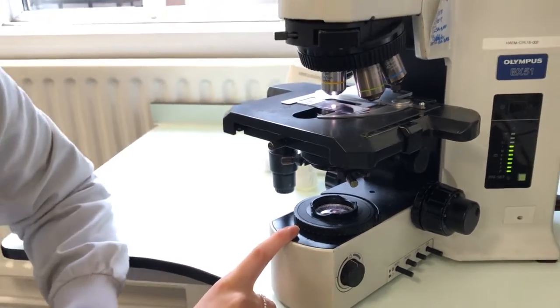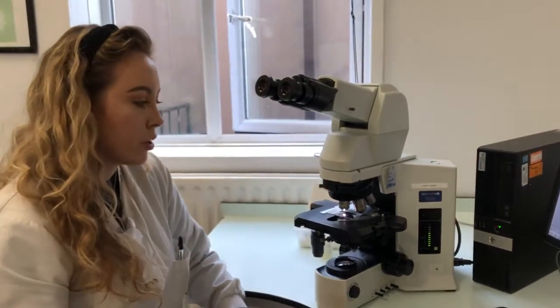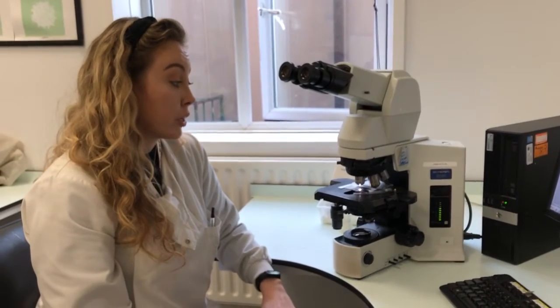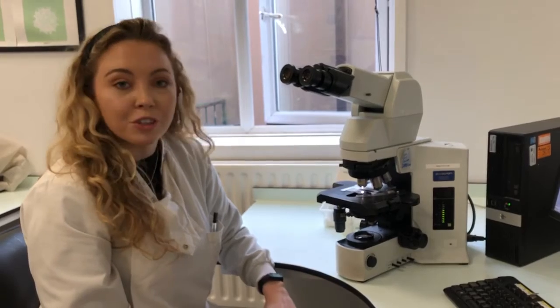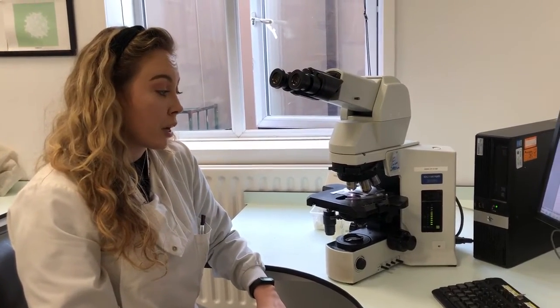So those are the main pieces of a microscope, and I suppose a microscope is an essential tool for us scientists in the hospital. We use it every day, and it's important that we look after our microscopes and make sure that they're functioning properly so we can see the blood films and we can pick up any bad results and help the patients.